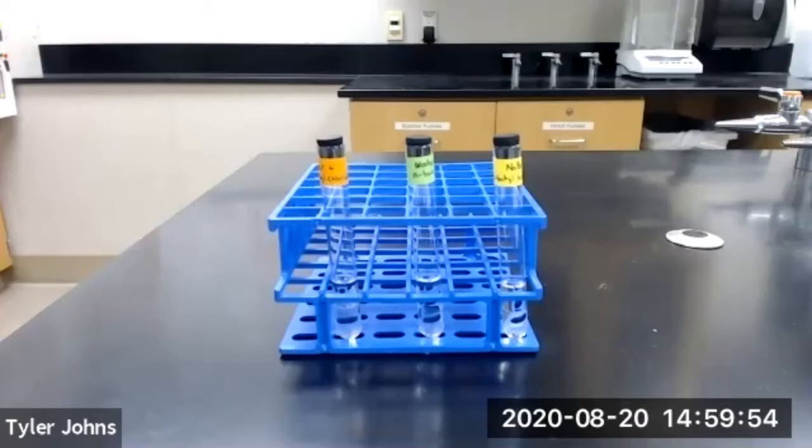If the water adds to the volume of the top layer then the top layer is aqueous. If the water balls up and forms a third layer then the top layer was organic. Let's get started.